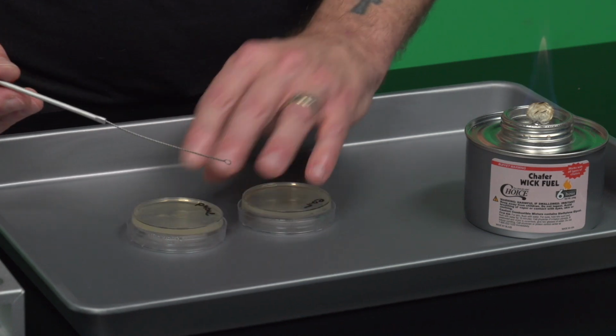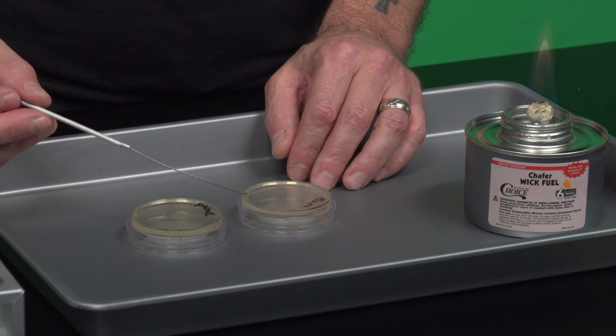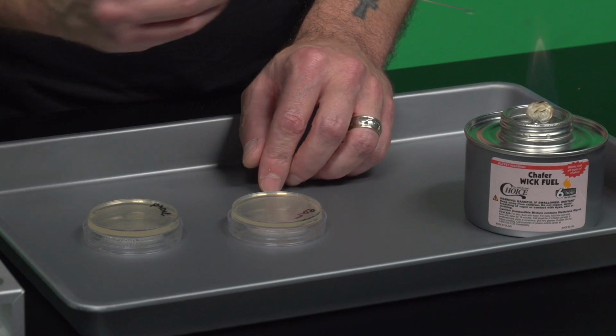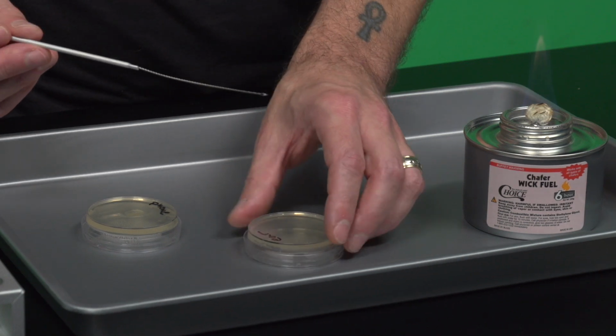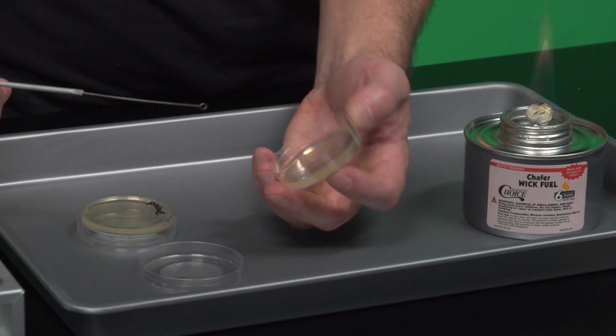And now what I'm going to do on these last two is, just for the sake of showing you without waiting the 20 seconds in between each one, so this video isn't super long, I'm just going to go ahead and not do my extra sterilization, my super important sterilization of the loop in between each streak, simply to save time. Okay, but don't you do this, right? This is just to illustrate a little bit more quickly, so we're not sitting here for a really long period of time.